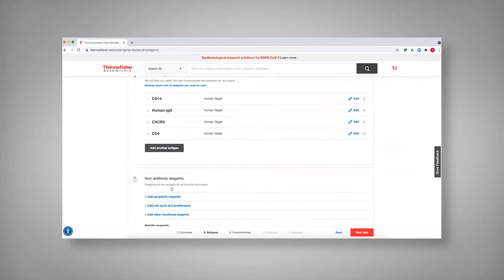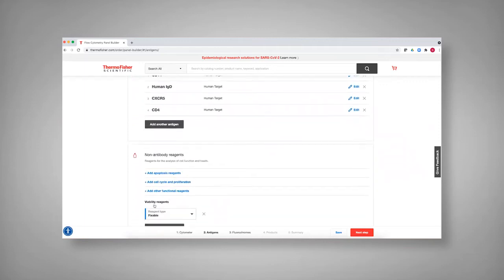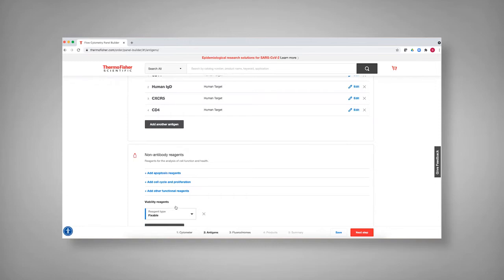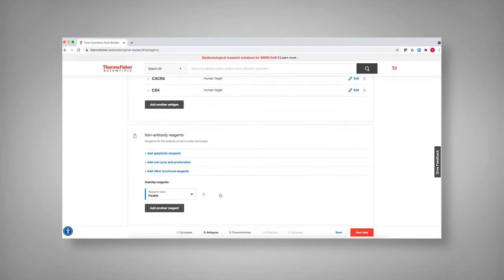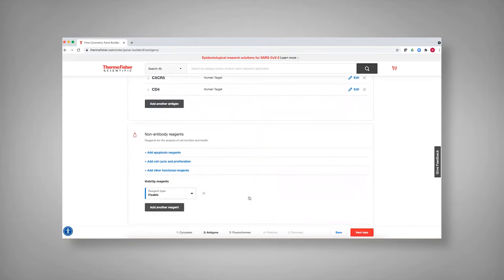And then in addition, in this case, we want to have a viability reagent. And since we're using NovaFloors, we'd like that to be a fixable viability dye. And so you can actually select which that you want. You don't want to use an intercalating DNA dye with the NovaFloor reagents.